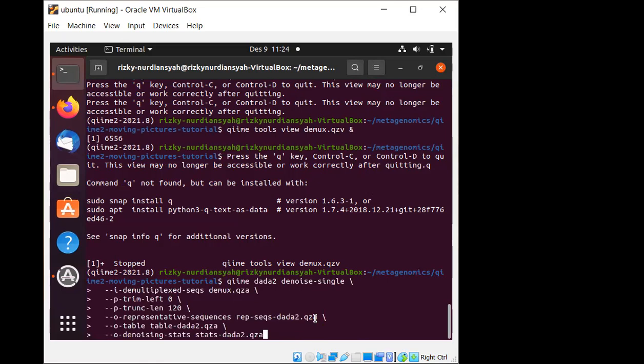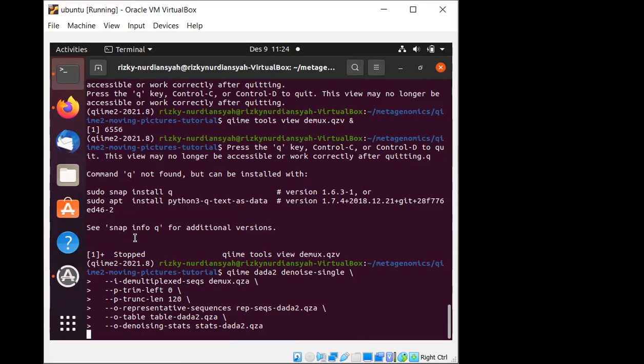So now let's enter the command to work on the data. This actually takes a little bit longer, but I did check, it's not that long, at least in my copy. You just need to wait.